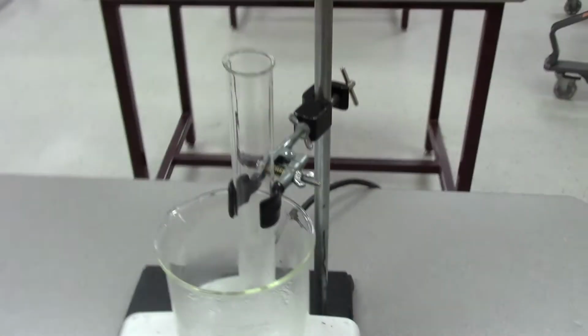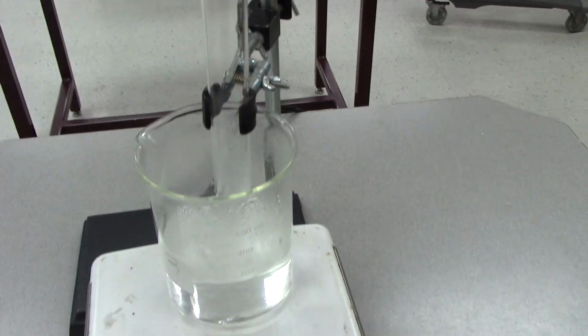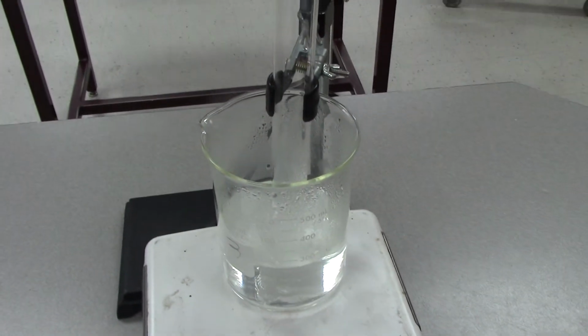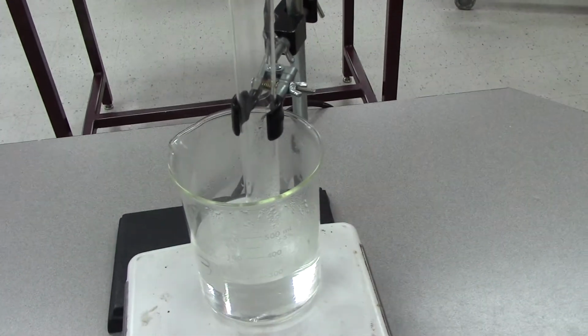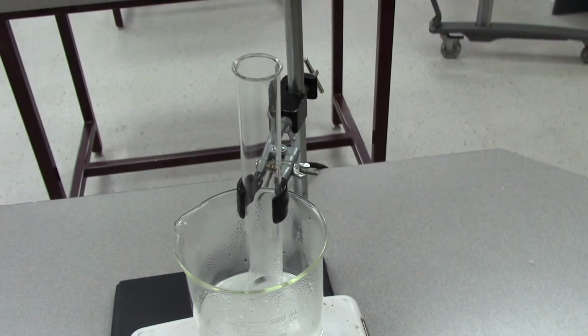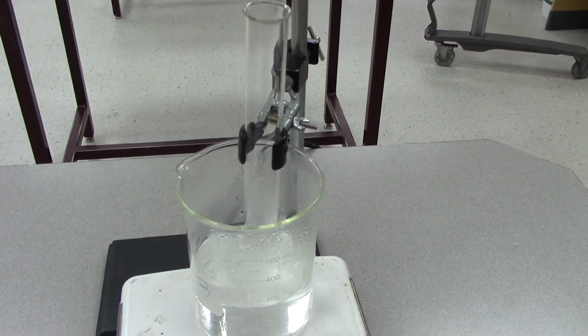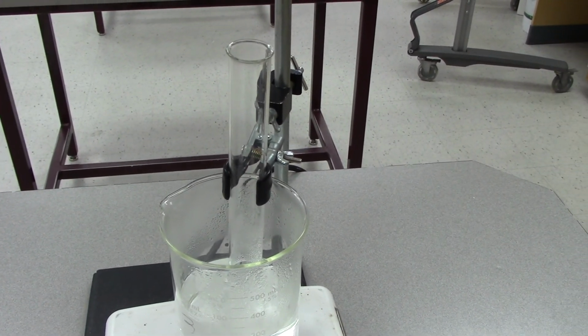Okay, and then we let the ester reaction go. I'm going to let this sit for 10 to 15 minutes. I'm going to sign off here for a second because I need to check in with the class, and I'll be back in a few minutes once the reaction's gone.